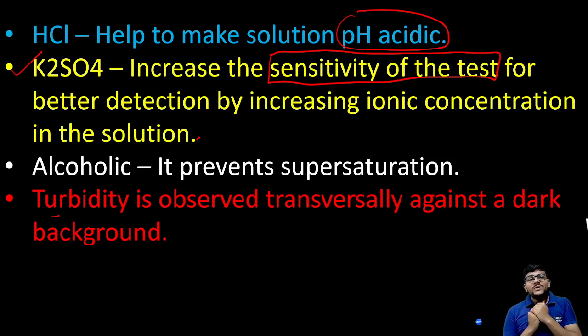So you have to use a dark background, because the turbid solutions, test and standard, are white. To check the minute difference in the turbidity, and to get a very accurate result, we use the dark background. Got it? And in the upcoming limit tests, we will discuss that we use a bright background.